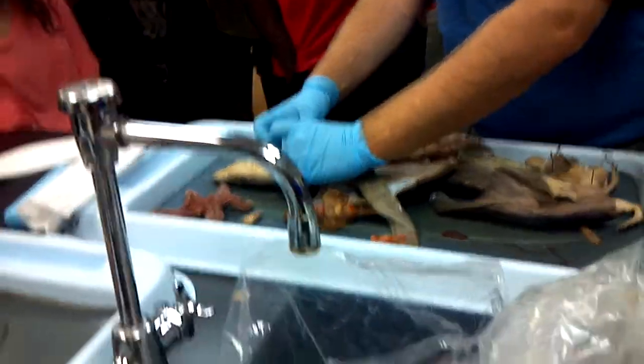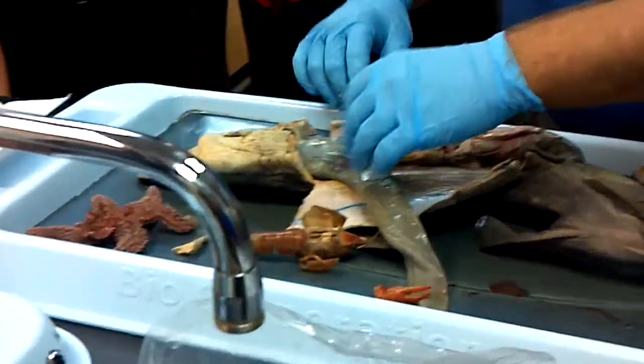We have the heart, liver, and we've got three lobes — left and right, and the medial.